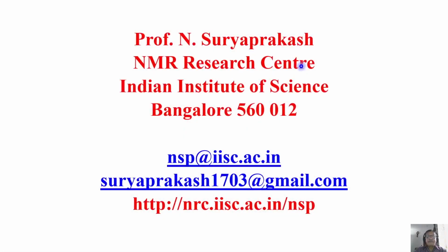Welcome back. In the last class, we analyzed a couple of proton NMR spectra, and we learned how to interpret the spectrum based on the chemical shifts, the intensity pattern, the multiplicity pattern, and coupling information, varieties of information you can consider.